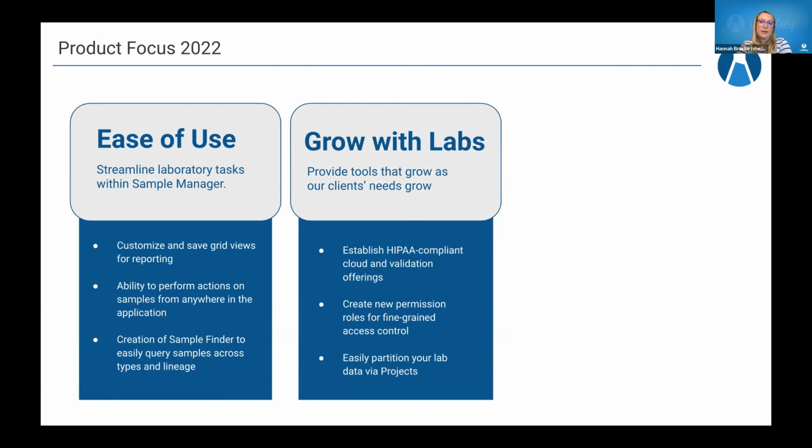We also really wanted to focus on this growing with the laboratory needs and ensuring that we're one step ahead of the game, if you will, on that. So really establishing those HIPAA compliant cloud offerings as well as validation was something we set out to do this year and has been really exciting. We've also created new roles for folks to use, such as the workflow editor and the storage editor roles, to really provide more fine-grained access control over the data within the system and what can be done.